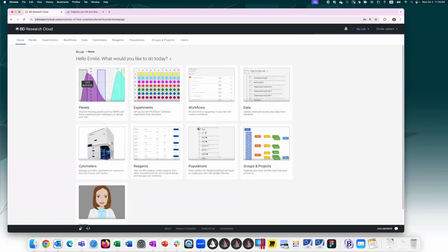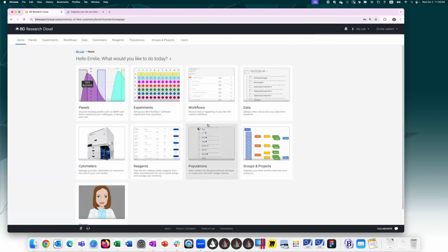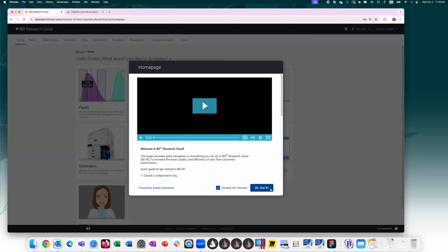The very first time you log in, you have a tutorial video that gives you a little tour of BDRC. I recommend you watch that. And every page that you go to in BDRC will have different tutorial content. So the first time you go to these different places, the tutorial will pop up. If you don't want to see these anymore, just disable the tutorials, press OK. They won't pop up anymore automatically. Just know that if you need more information about any page that you're on, you just click this little tutorial and it'll provide additional content there as well.